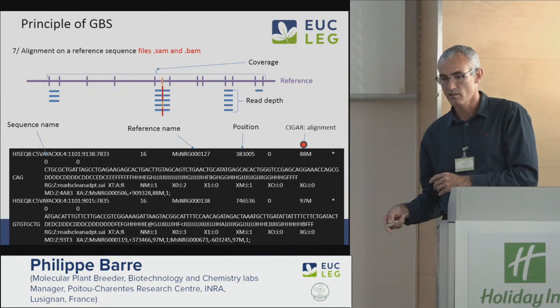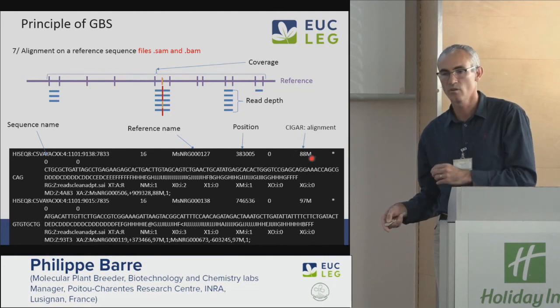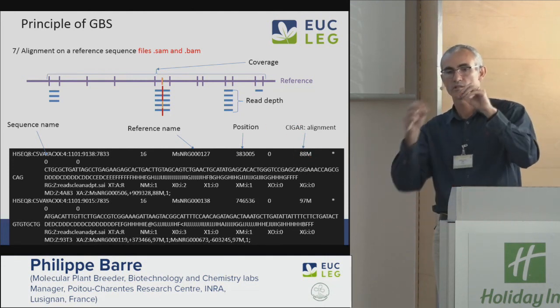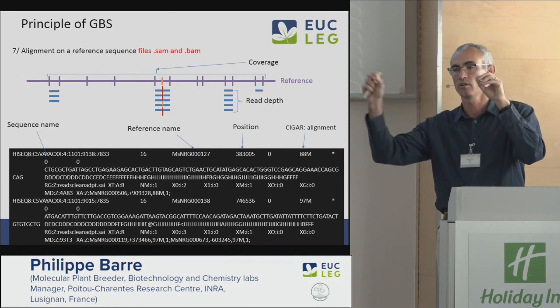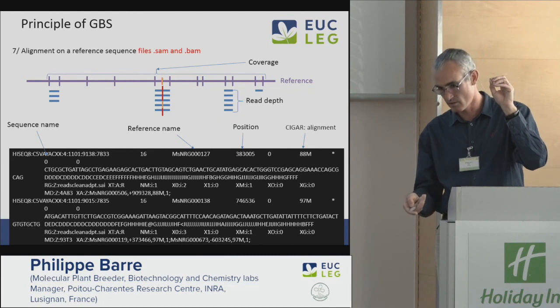And then here, it's the CIGAR code alignment. And this tells you, okay, your sequence is along the reference sequence without a stop. That's what it says here.